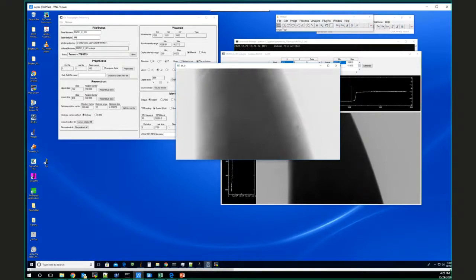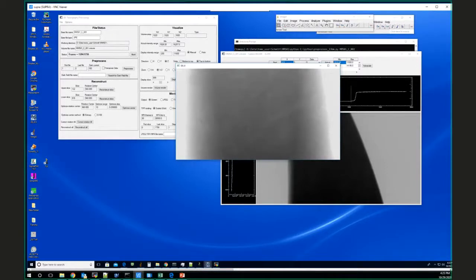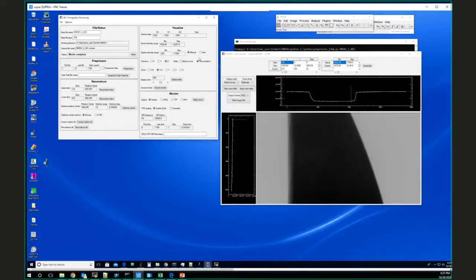But like I say, you can see that the flat fields are pretty well corrected here, but not these dust particles. We're still seeing those bright dust particles. So they haven't normalized out. Okay, so that's what the corrected data look like.